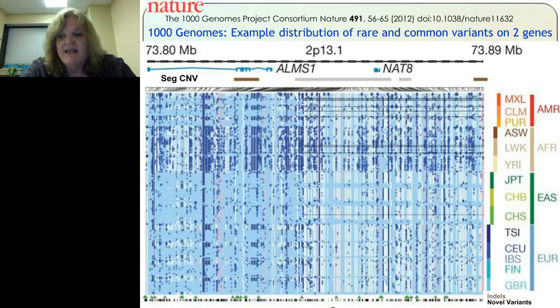On the right-hand side, going across the screen, is each individual. Each individual is very small. It's only a very thin line. I think some of the little black lines you see there are probably representative of a single individual. We have 4 populations represented here.